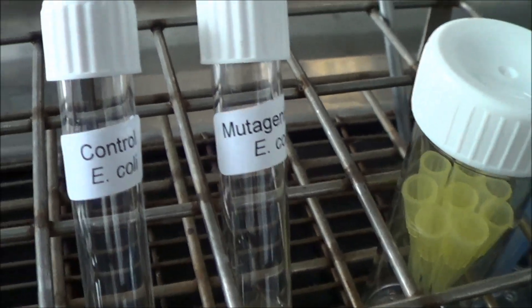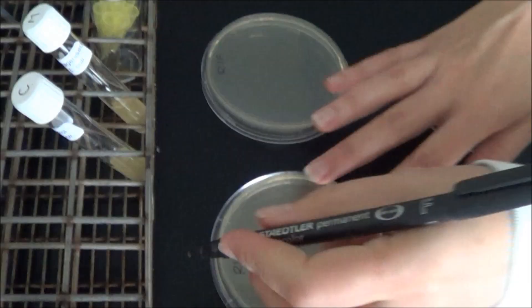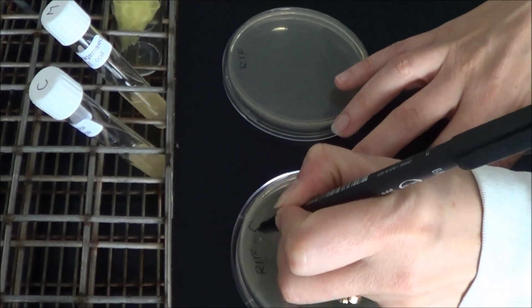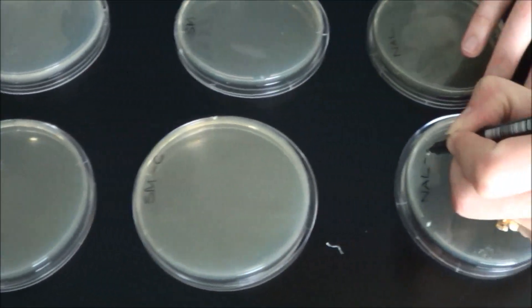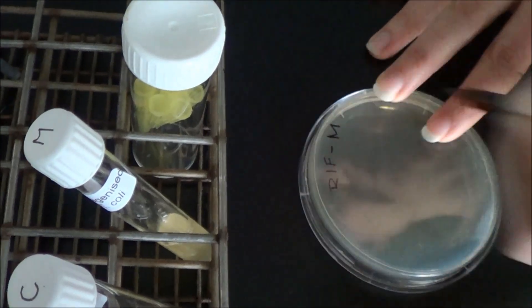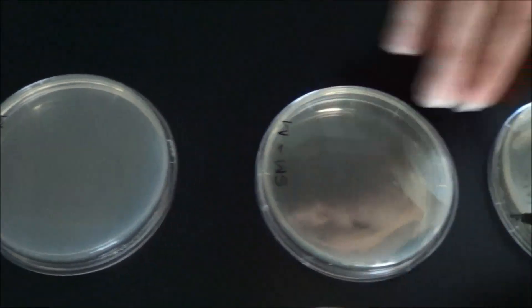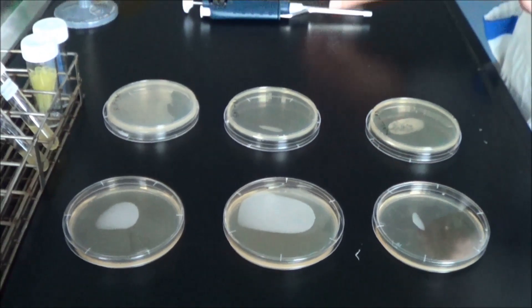Label one set of plates as controls or C, and the remaining three as mutagenised or M. So there should be two rifampicin plates, one control and one mutagenised; two streptomycin plates, one control and one mutagenised; and two nalidixic acid plates, one control and one mutagenised.